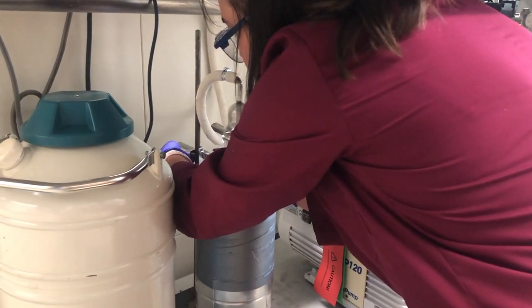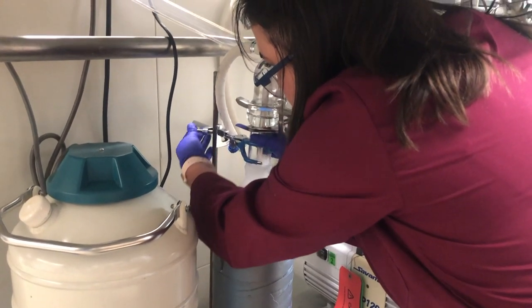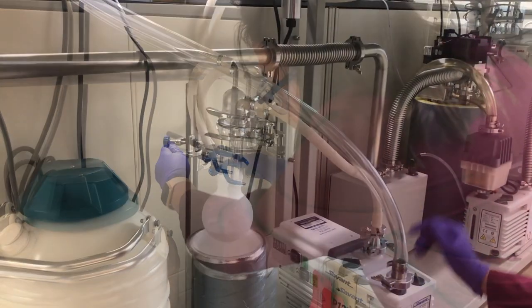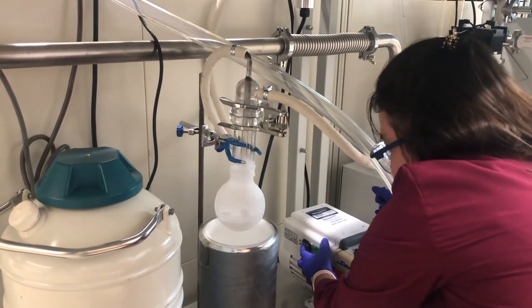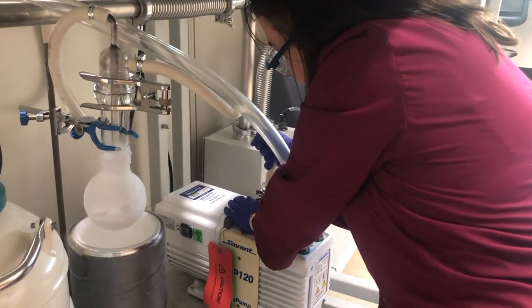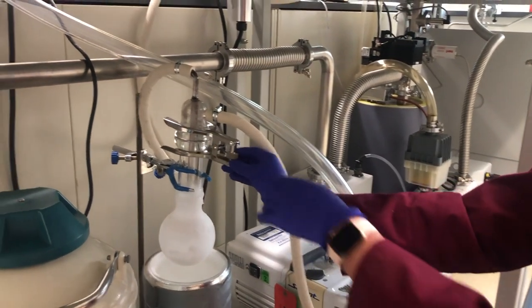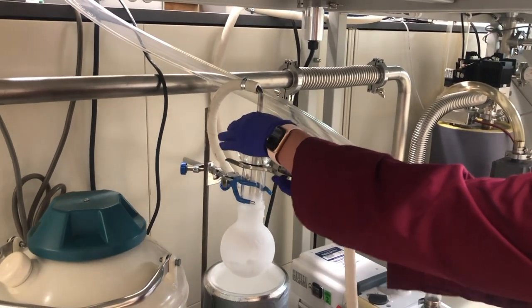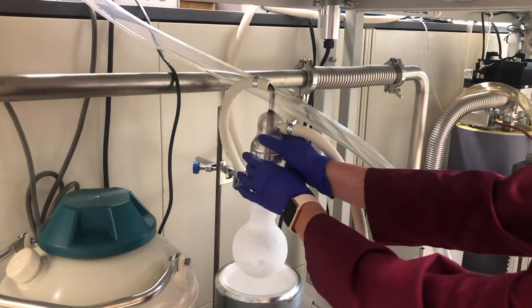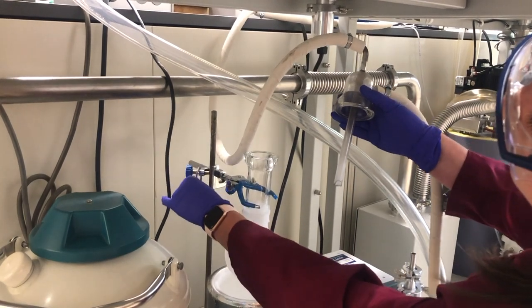The first two steps are to raise the trap out of the nitrogen and turn off the vacuum pump. Assuming you do these two steps relatively quickly, it shouldn't really matter which occurs first. However, I prefer to raise the trap before turning off the vacuum. Remove the vacuum hose from the pump to break the vacuum and bring air back into the system. You can then disassemble the trap to remove the o-ring.